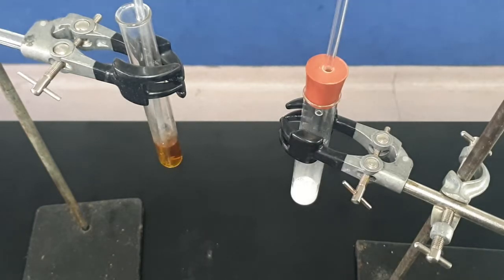And there we have it. Our solution on the left, which was water, which has now had carbon dioxide run through it, has turned yellow, showing that its pH has become acidic, proving that the carbon dioxide is coming from this reaction.